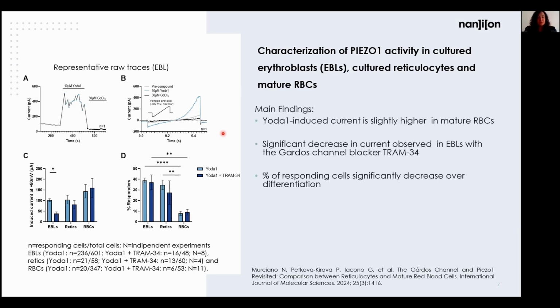Then for the statistical analysis, I looked at 2 parameters in the 3 samples, focusing only on the positive voltages, so only on +80 millivolts in the ramp.